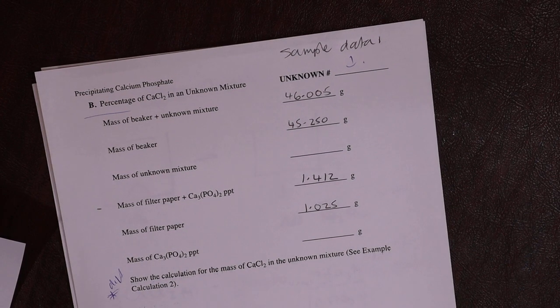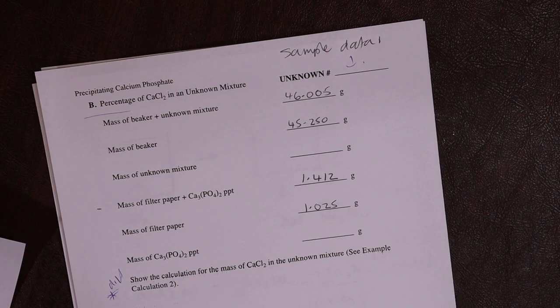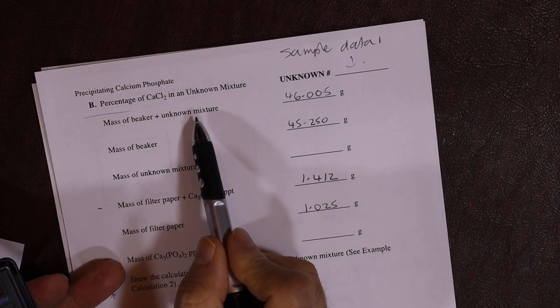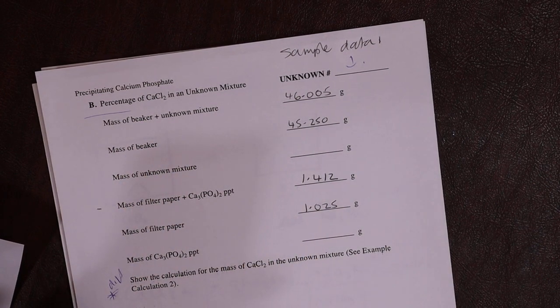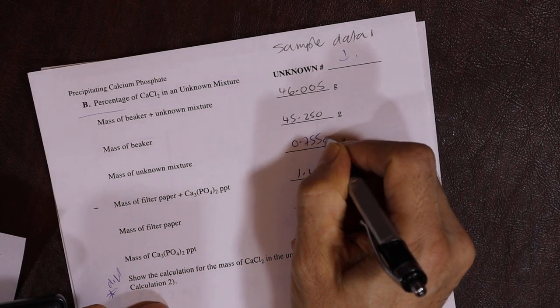I'll show you how to do that on a piece of paper in a second, but this top part is basically the same. So let's just work out those numbers again. Follow along with your data table. Your numbers will be different, but the same idea. So the mass of beaker and unknown mixture, subtract mass of beaker, gives mass of unknown mixture: 46.005 minus 45.250 equals 0.755 grams.